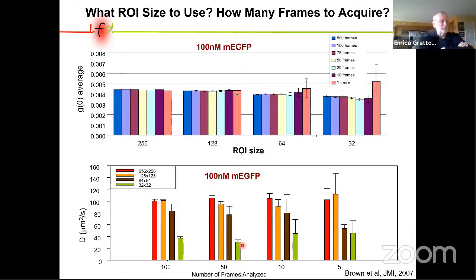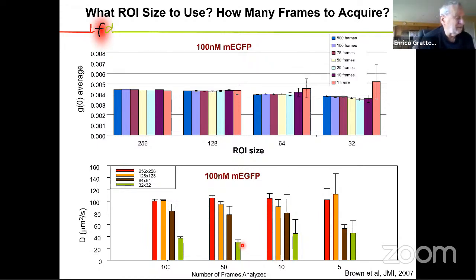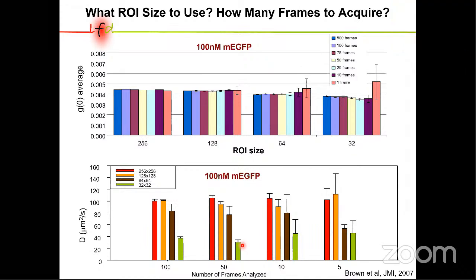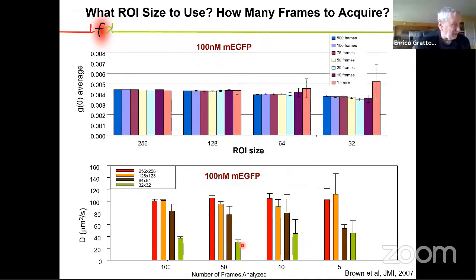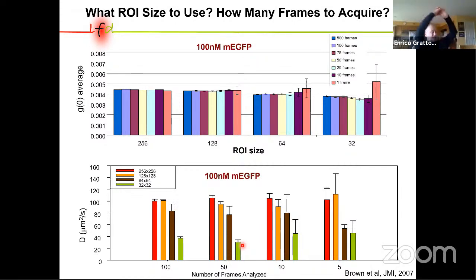Okay, so anyway, let other people ask questions if they have any. If you're doing the analysis, you can look at your correlation function and see if it's truncated. And if it's truncated, you're going to make an error. Yeah, of course, I understand that. But people are trying to use RICS in micro and nano channels, for example. And there, of course, you cannot use RICS as an image. You can use line scan, just a line within a line, but not within an image. This is right. Okay, so anyway, I wanted to simply clarify this principle.